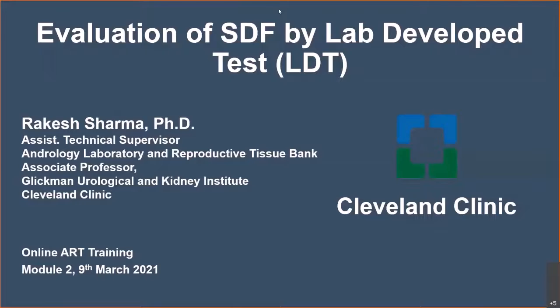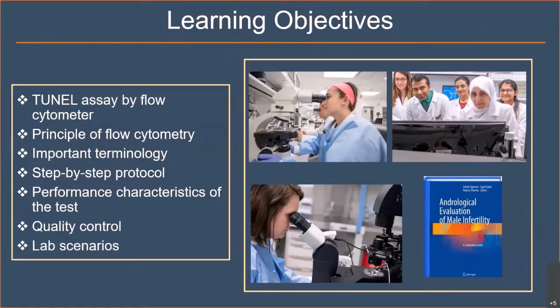Rakesh, you can begin. Thank you, Dr. Agarwal. Good morning. This is going to be my second talk. The learning objectives are the TUNEL assay by using a flow cytometer, understand the principle of flow cytometer, and more important, I'm going to highlight the terminology used in the measurement of sperm DNA fragmentation by flow cytometry, and also highlight some of the lab scenarios as well as the quality control in using sperm DNA fragmentation by flow cytometry.